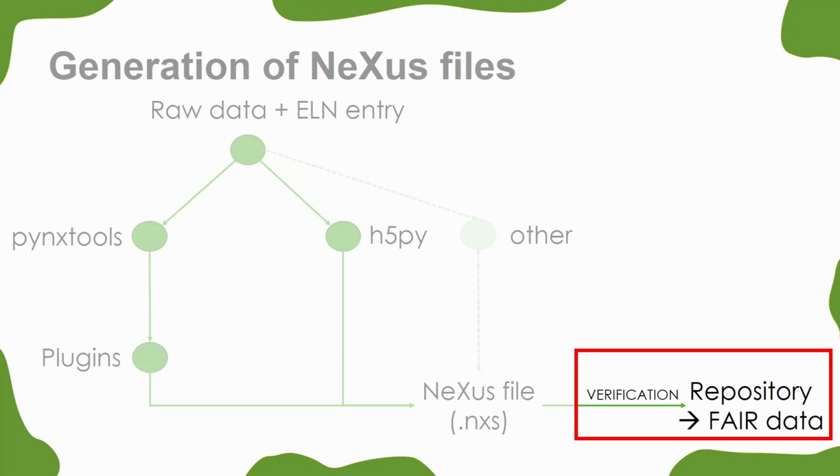If a group or attribute is already available, will it be overwritten if I use it again? That was the question in the chat. I think with this package, it will just throw an error message that this field already exists, and will cancel the process, if I remember correctly.